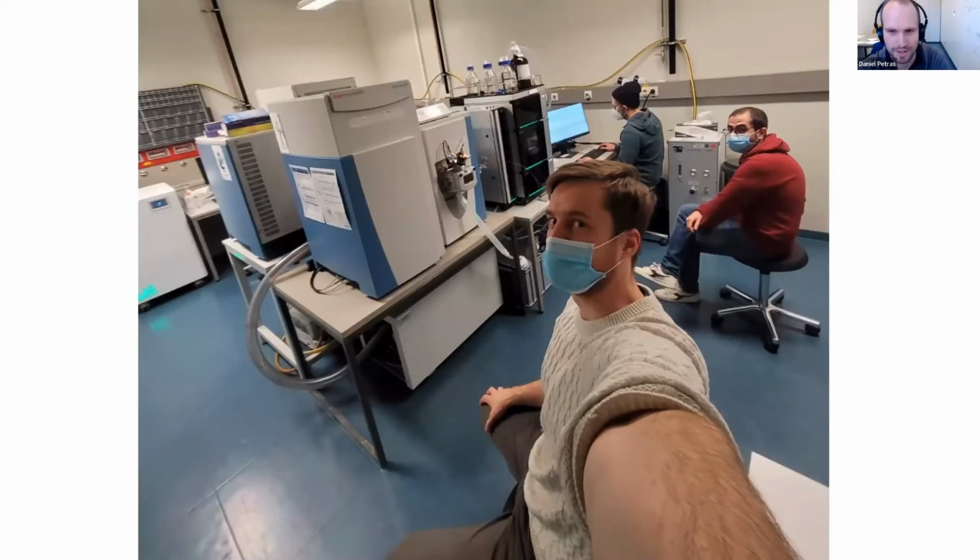Okay, so just to give you an idea how this looks, this is a photo Raphael took, who might be in the audience, together with Paolo and myself. So this is our HPLC system we have in the lab. So here, this black tower in the middle is a pump and an autosampler and then a column oven, where we do the separation of the molecules by reverse phase HPLC typically. And then you can see there are capillaries connecting the two, and then going to this little box with all the wires. This is our ESI interface, and then we have the Q-Exactive mass spectrometer at the end.